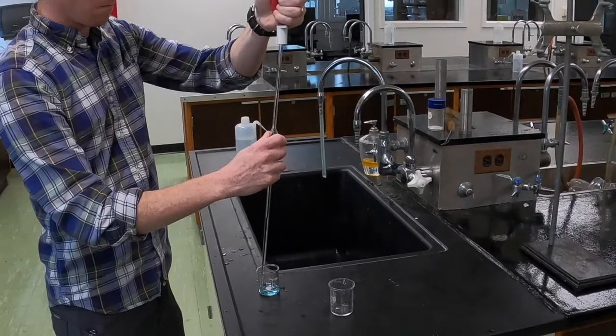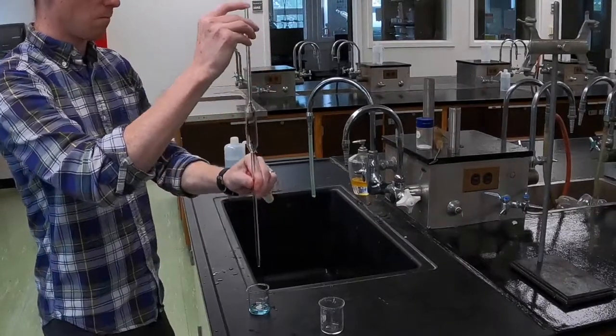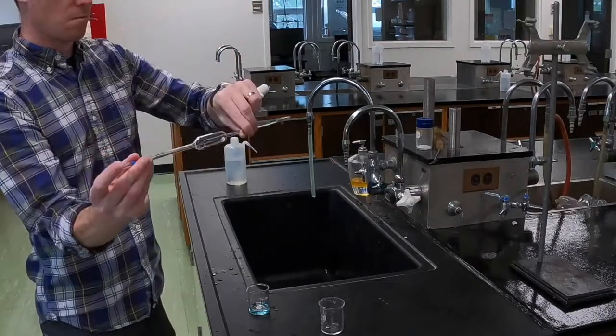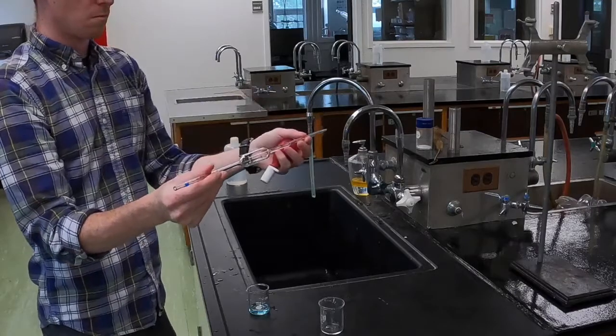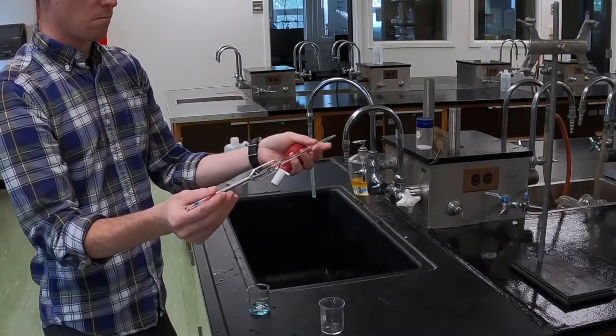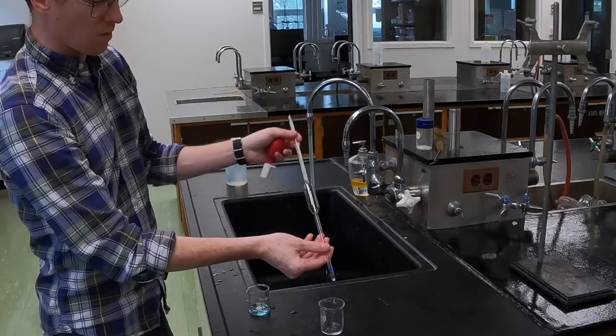So you take a small portion of your solution, place it into a small working beaker, and you add roughly 1/10 of the volume that the glassware can hold into the pipette or burette. You tilt it sideways and you rinse, coating the insides of that glassware, and then you drain into a waste container. And at this point, your glassware is ready to fill and use.